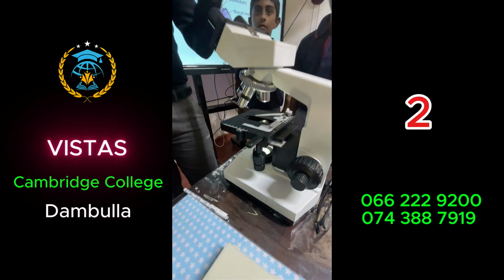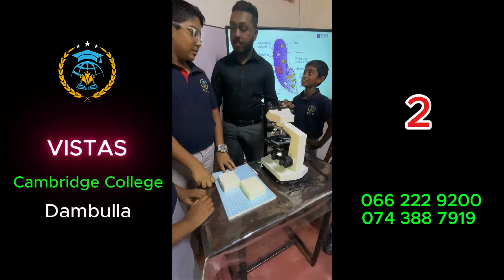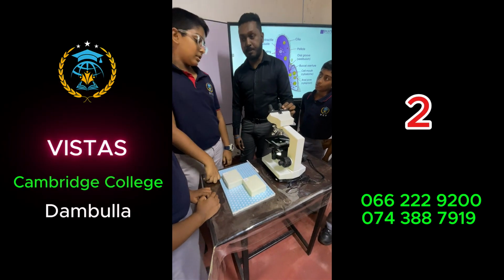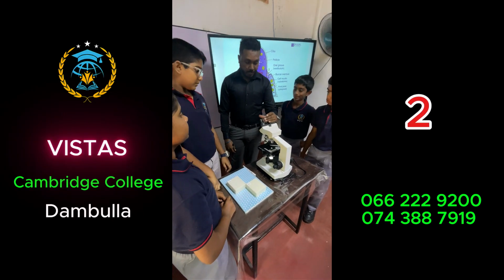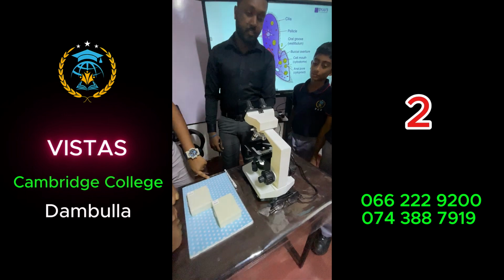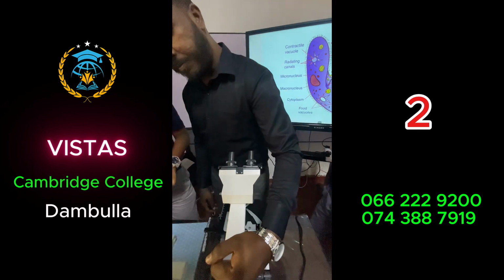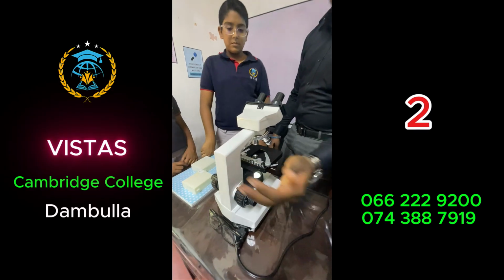And if you think about parts, you know what these things are? These are eyepieces. Yeah, it is called an eyepiece. Those are lenses, but this is called an eyepiece. And these are the objective lenses. And this is our arm. This is the arm, and this is the base.